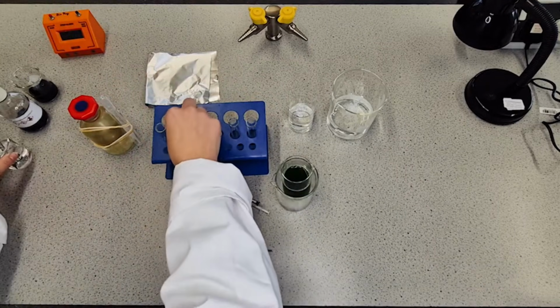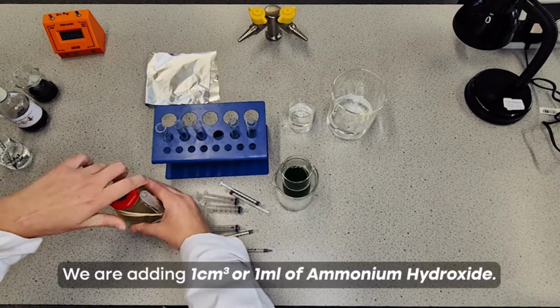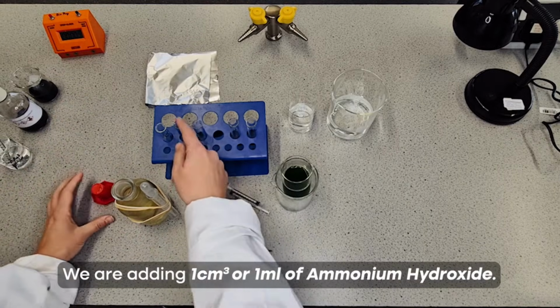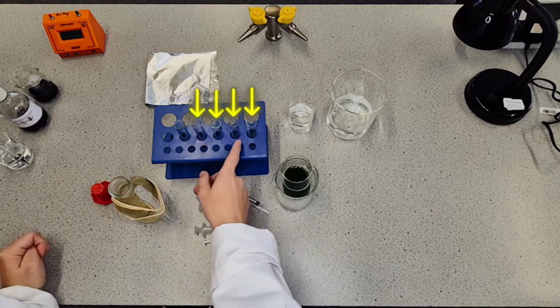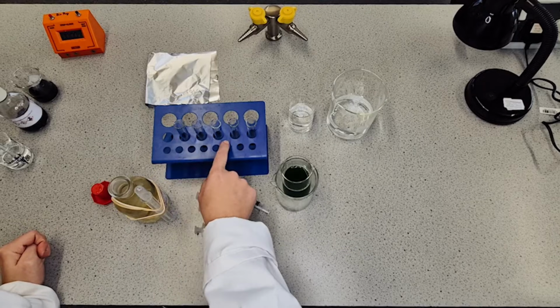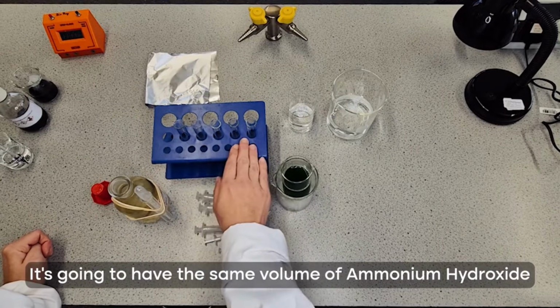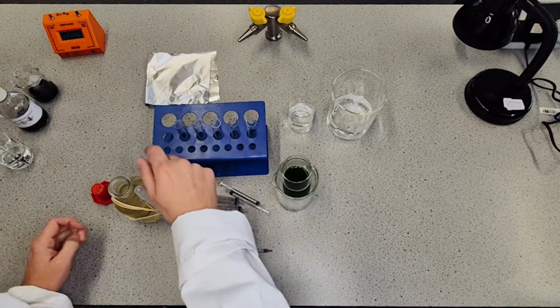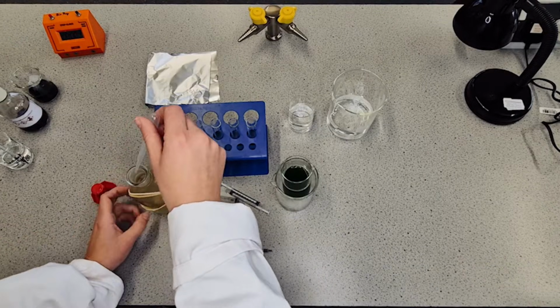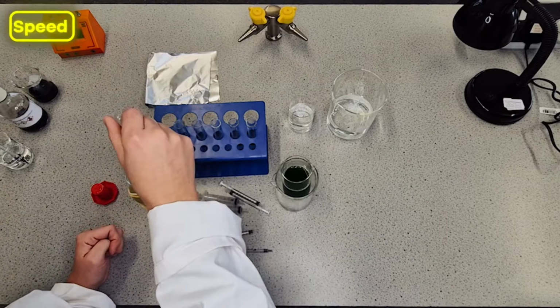And then for the last test tube that I didn't put the distilled water in, instead we are adding 1 centimetre cubed or 1 milliliter of ammonium hydroxide. So these 4 all have distilled water in. This one doesn't, because instead it's going to have the same volume of ammonium hydroxide, but because we have to have the same volume in all of them, that's why these 4 had to have distilled water. And this one has got the ammonium hydroxide.